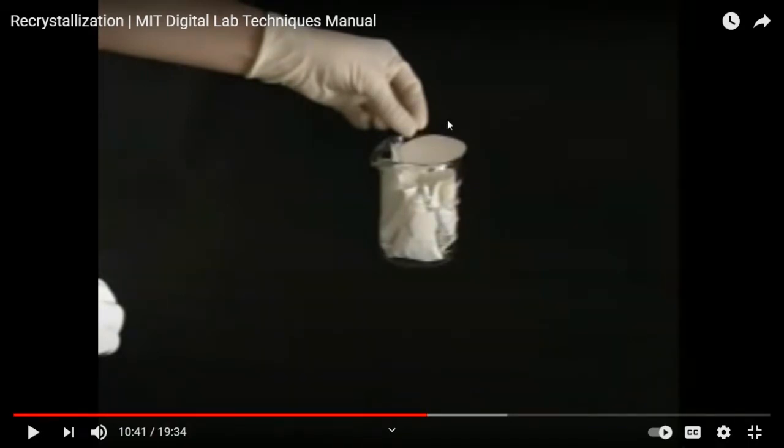You see what she did? She had a paper on the table and she did not flip it, right? She put the side that touched the table over it. Oh my God, right? She should have flipped it.